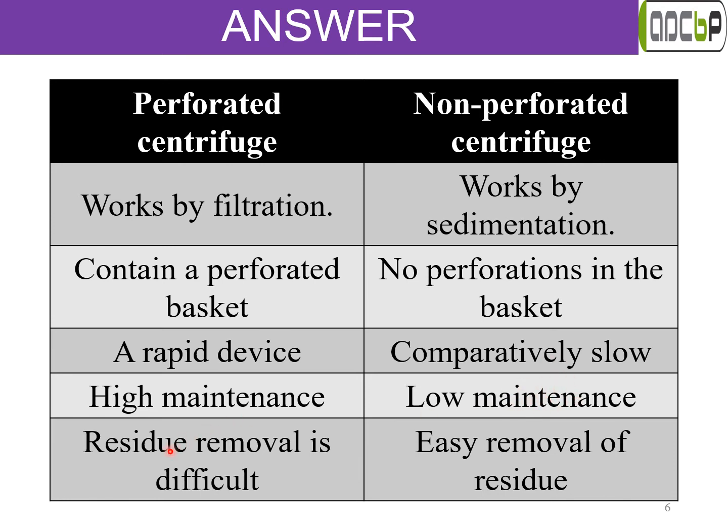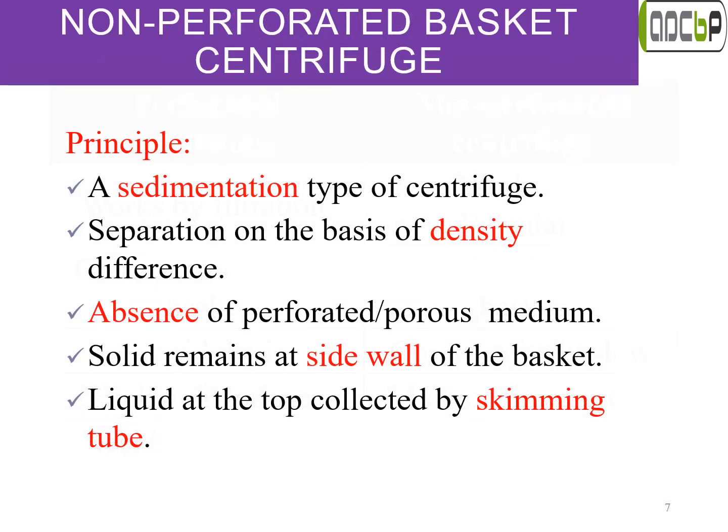Lastly, the removal of the residue is difficult in perforated centrifuges as it may remain stuck or entangled in the perforations of the centrifuge, whereas residue can be easily removed from the non-perforated centrifuges.